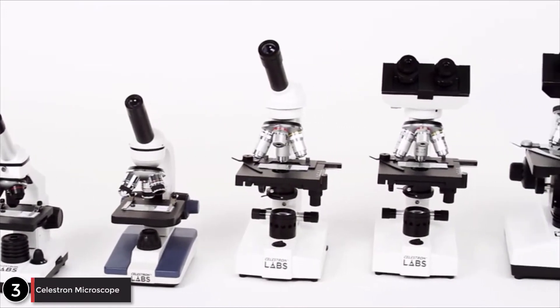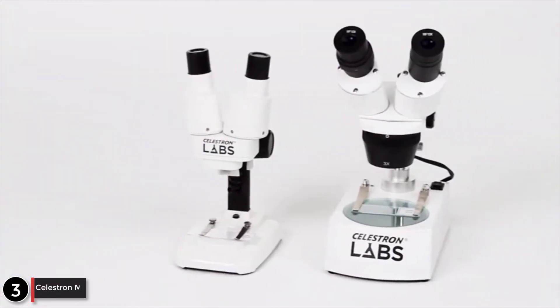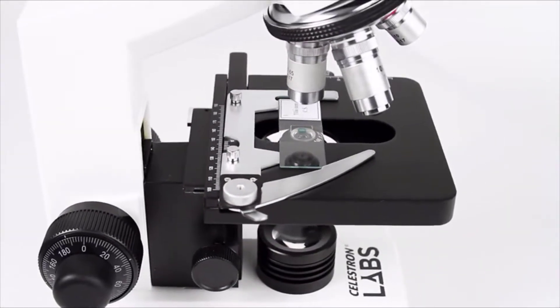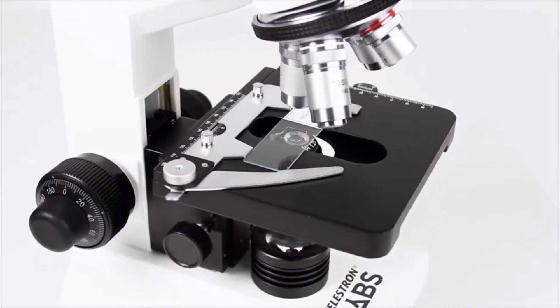Introducing Celestron Labs, a new family of compound and stereo microscopes by Celestron. Made from high-quality parts, these metal-bodied microscopes are durable enough for use in the classroom or a professional lab.